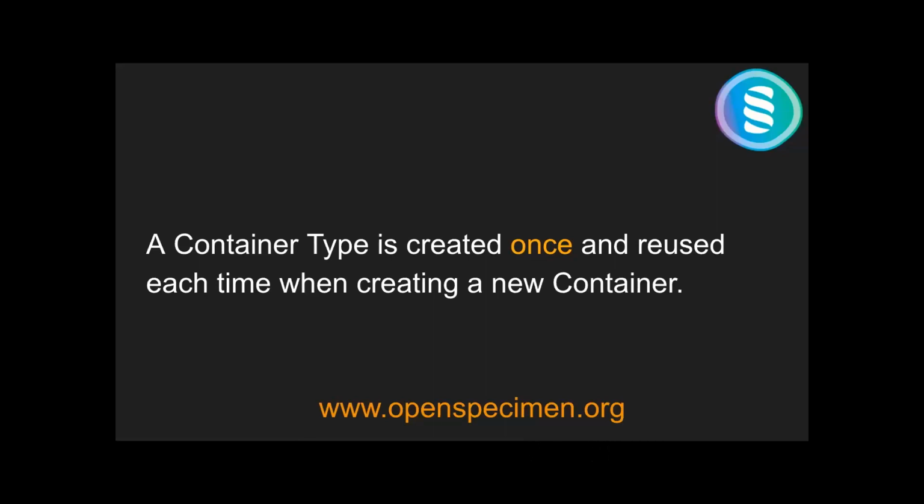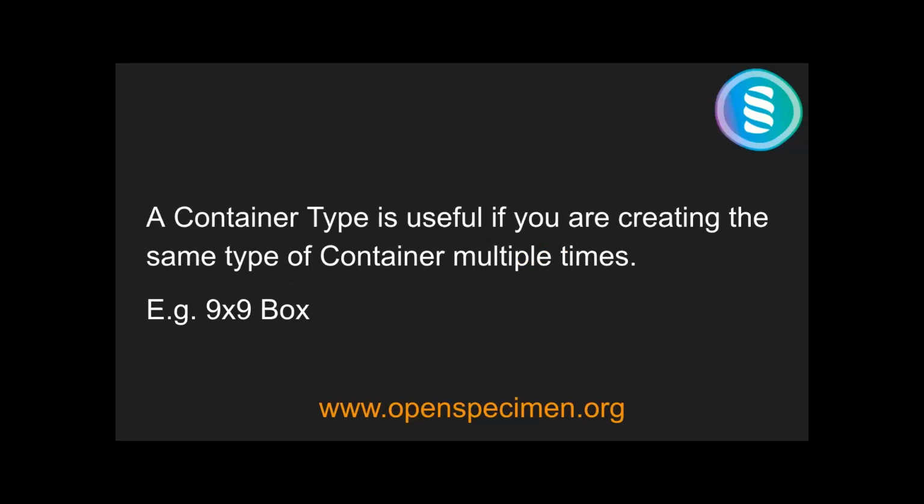More importantly, the entire hierarchical structure of the container, like freezer, shelf, rack, drawer, box, can also be configured with the help of container types. I will show a small demo shortly, and it will be clearer for everybody. This is what I just told: a container type is useful if you are creating the same type of container multiple times. Now I will show a small demo.